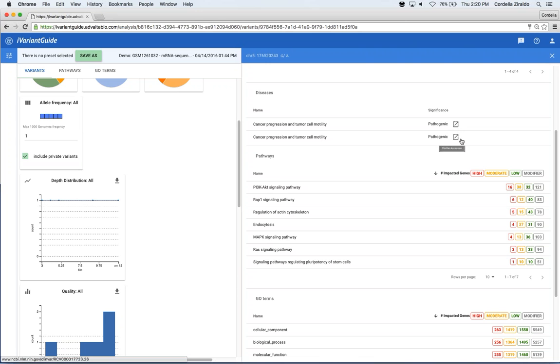And each of these is a separate link to a ClinVar accession, and you can link out and view all of the associated information. In many cases, there are also links to other databases with more information about the linked disease, such as OMIM, Orphanet, SNOMED, Gene Reviews, and a few others.